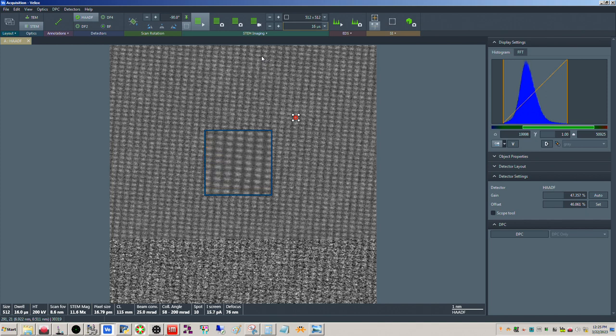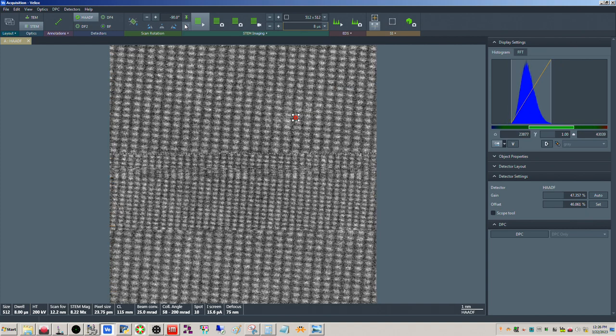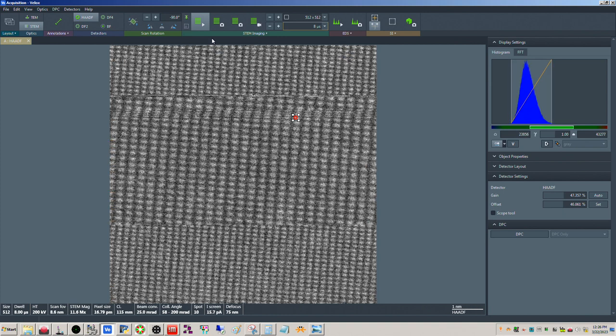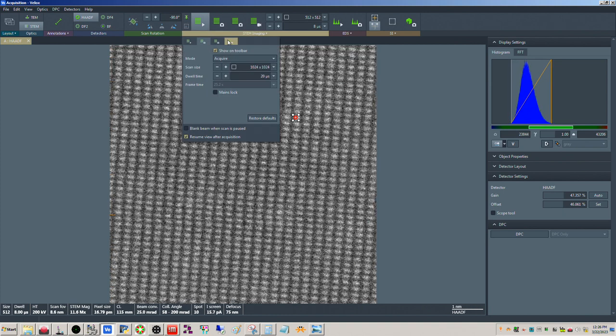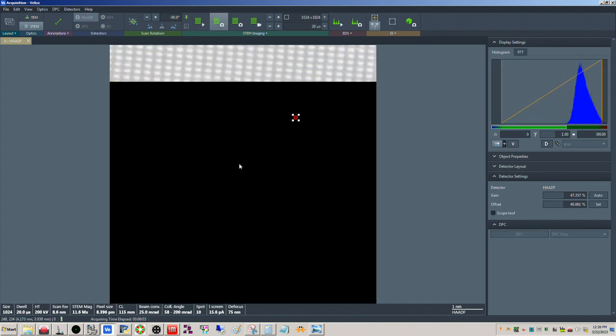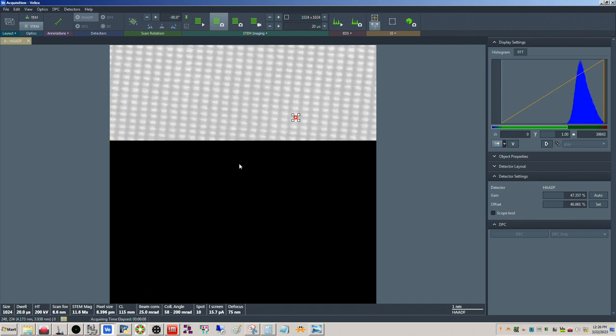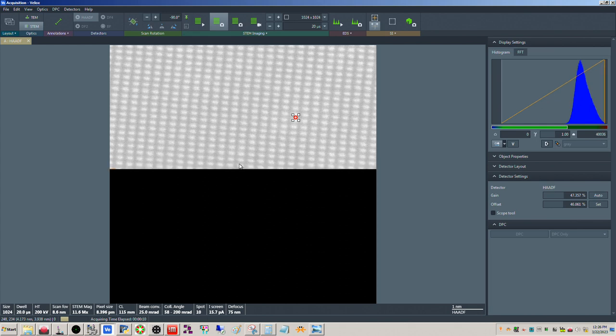Okay. So it looks fine there. It doesn't look astigmatic. The dumbbells are not well separated. Let me try here. Try a slower scan here. So I just changed the focus a little bit there. And we may need to try a little bit of a thinner area.